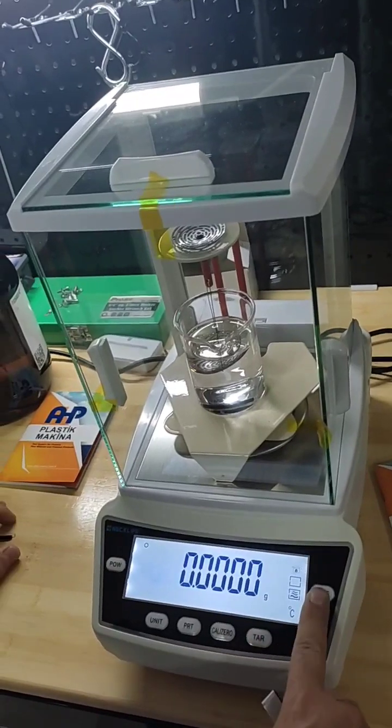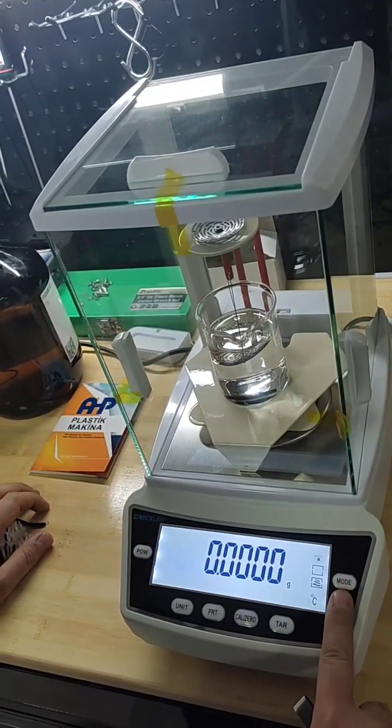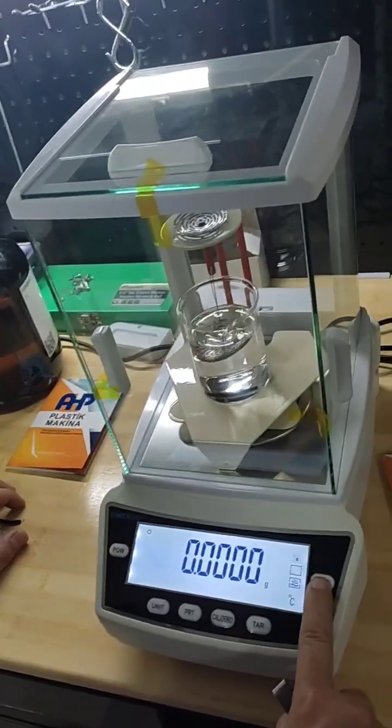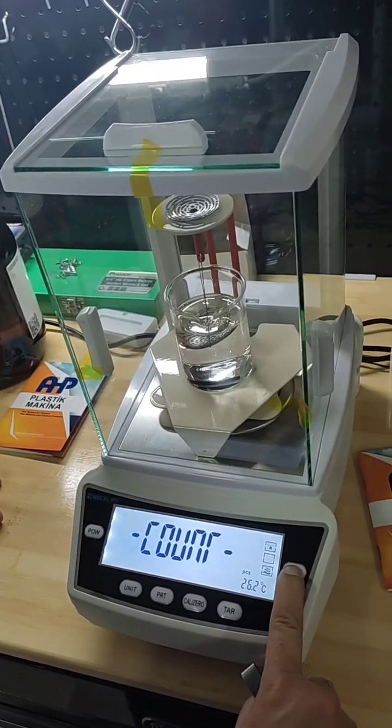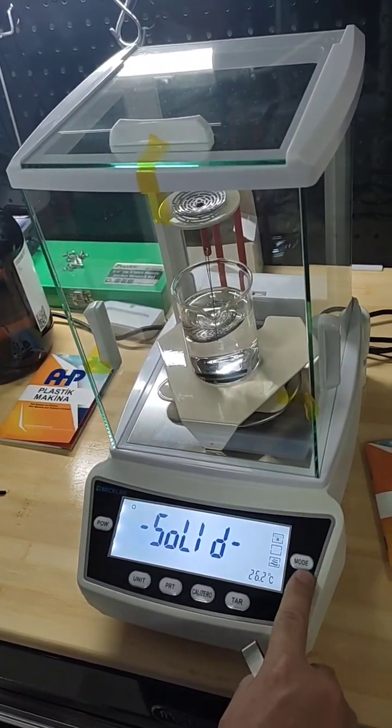I want to show you how to use the density mode of this specific brand of precise balance. Click on mode, keep the mode key pressed and you will see density here. Then release the mode key.